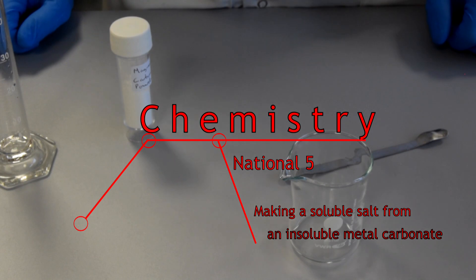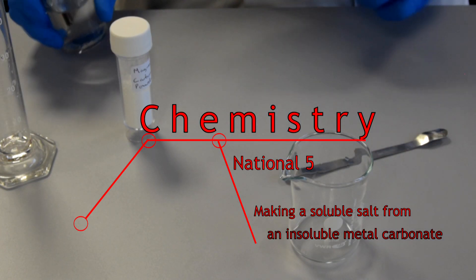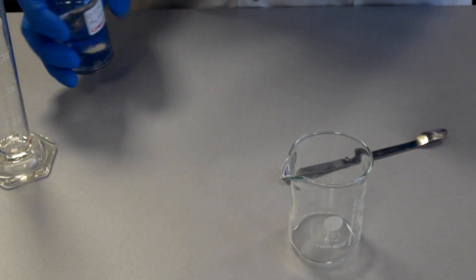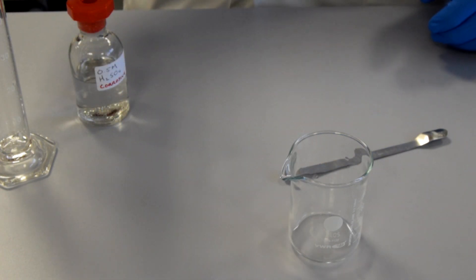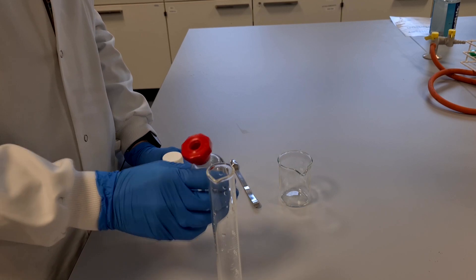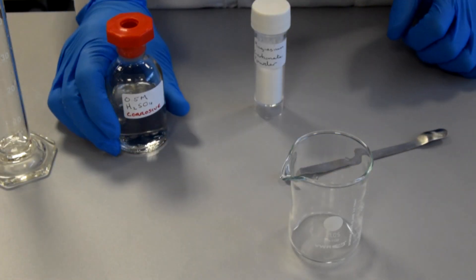In this experiment, we are going to make the salt magnesium sulphate, and we're going to make magnesium sulphate by reacting magnesium carbonate with sulphuric acid. Now, magnesium carbonate is an insoluble metal carbonate, so we can make magnesium sulphate by reacting magnesium carbonate with sulphuric acid.